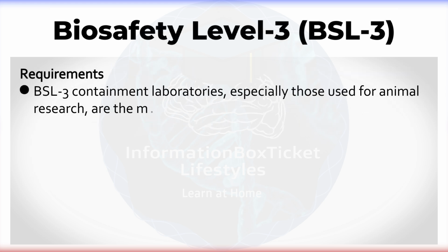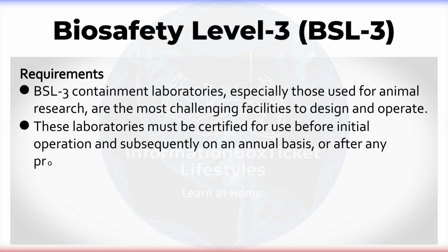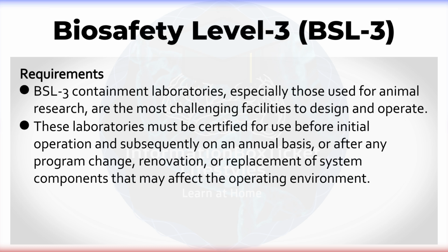Requirements. BSL-3 containment laboratories, especially those used for animal research, are the most challenging facilities to design and operate. These laboratories must be certified for use before initial operation and subsequently on an annual basis, or after any program change, renovation, or replacement of system components that may affect the operating environment.